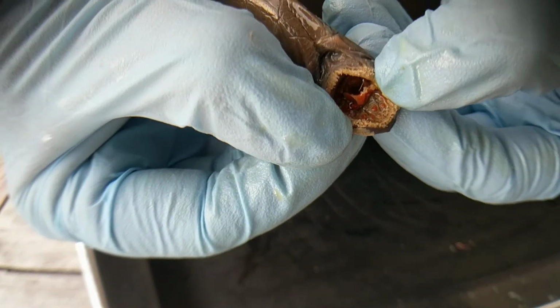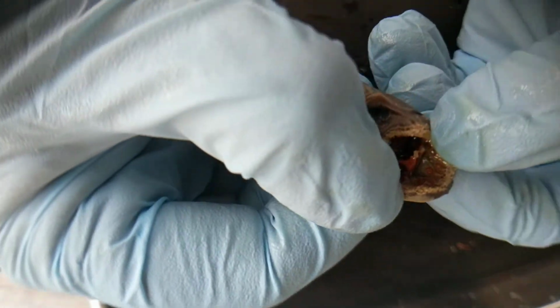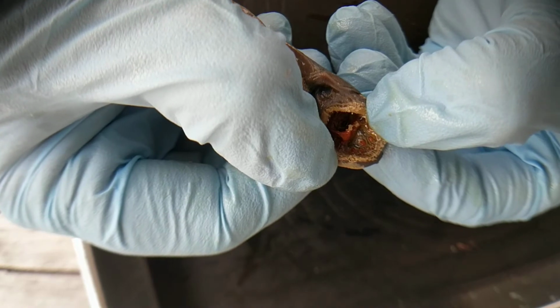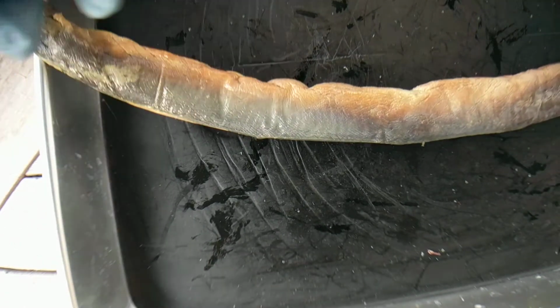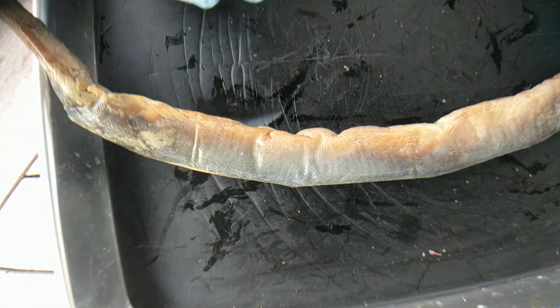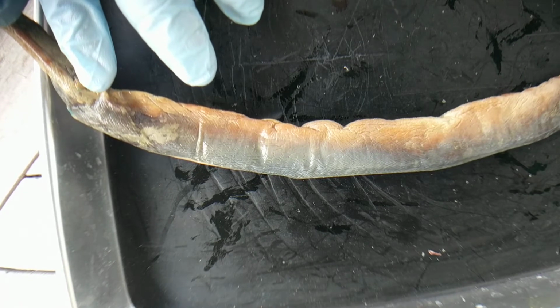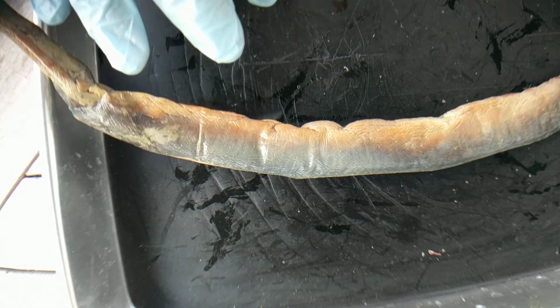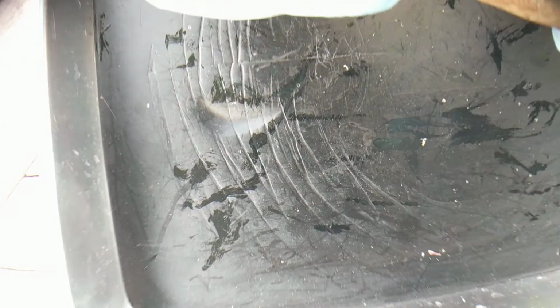And in the middle there is the tongue. And the tongue actually has teeth on it as well. Those are made of keratin. They're not real teeth. Made of the same thing as our hair and nails. What else? Oh yeah, I wanted to show you also, it's kind of subtle in lampreys, but they have eyes.